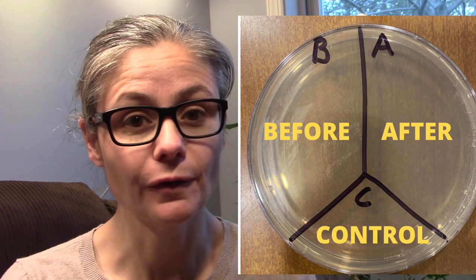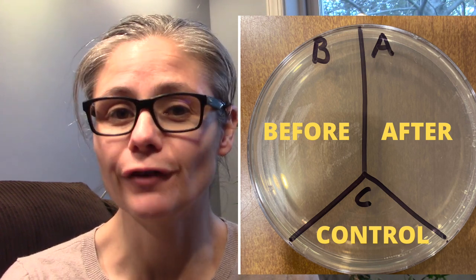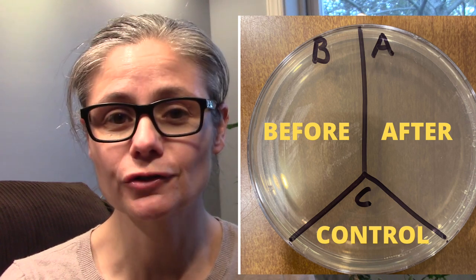I'm going to clean following the directions on the Comet bottle, take another sample and place that in A for after. C will be the control — nothing is going to go there. So let's see how well Comet disinfects my toilet bowl.